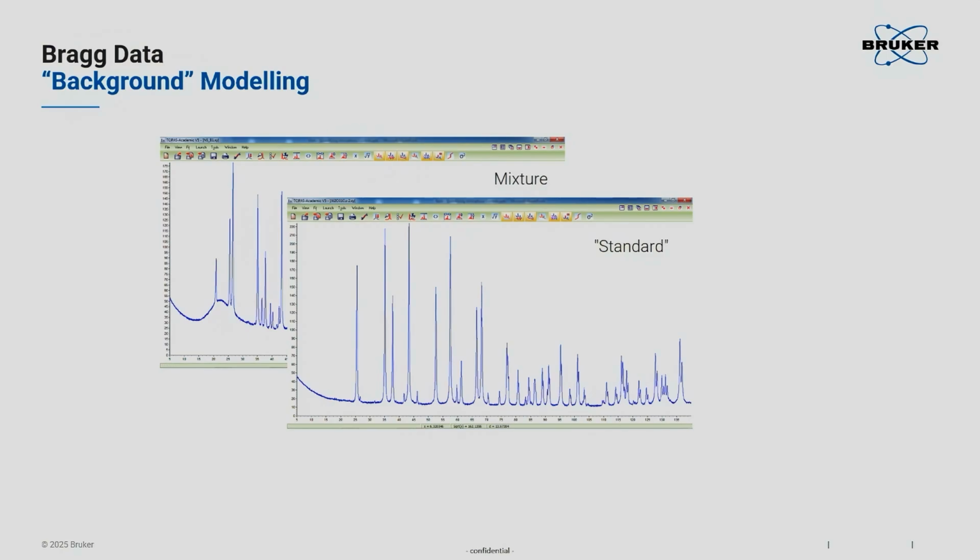Also, you have the component instrument scatter, but you have now a true second phase, which is unfortunately not part of your sample, so you couldn't quantify it. But given that you have the sample inside of the capillary for the beam, it is one and the same sample. So you have the contribution of your capillary, and that's exactly the same thing at the end of the day as here in the reflection case. In the reflection case, I can do quantitative analysis. In the capillary case, it doesn't make sense.